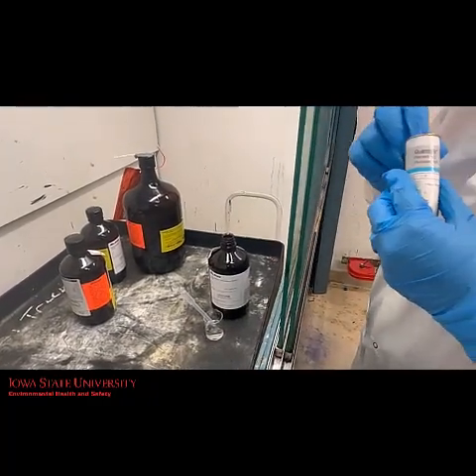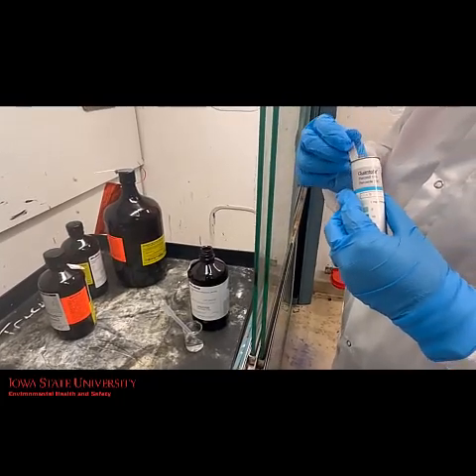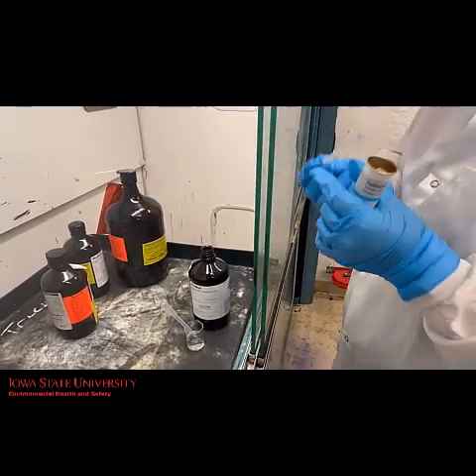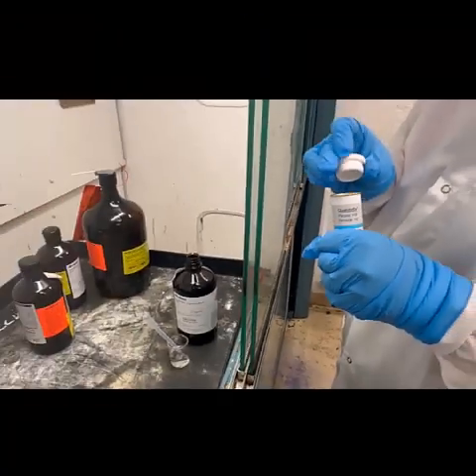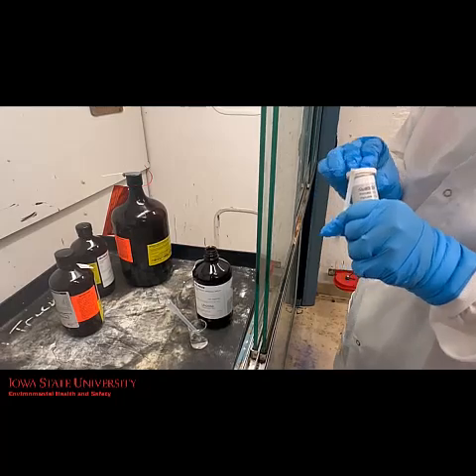First, open the container and remove only as many test strips as are needed. Try to avoid touching the test field during handling as much as possible. Close the container immediately afterwards.